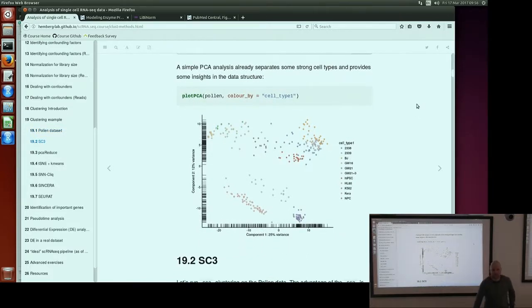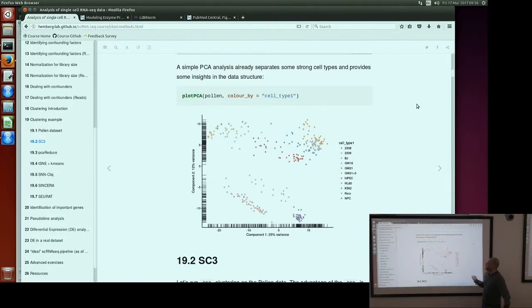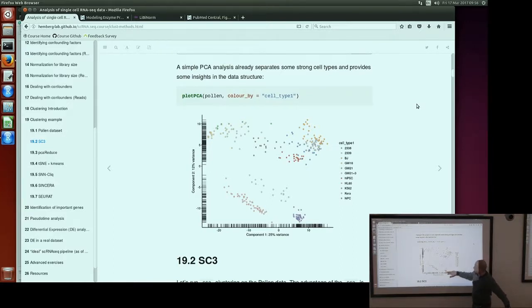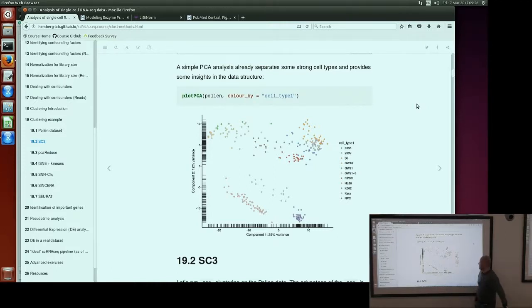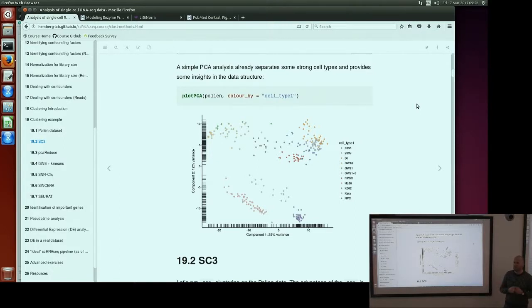If we plot PCA of this dataset and color by cell types, you can see that PCA already finds the majority of the cell types. For example, these three cell types are separated on the PCA plot. Here you have something that is a bit mixed — it's harder to identify groups — but still orange dots are here, red dots are here and so on. This shows you that if your dataset is of good quality and the cell types are separated, you don't need to perform any complicated analysis. A simple PCA plot can sometimes be enough to find your clusters.